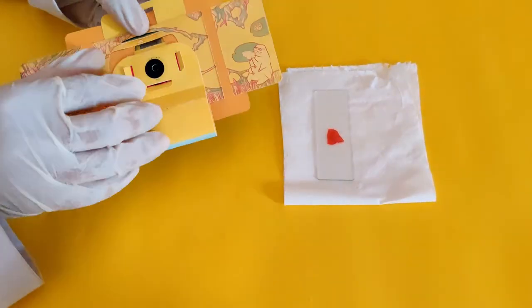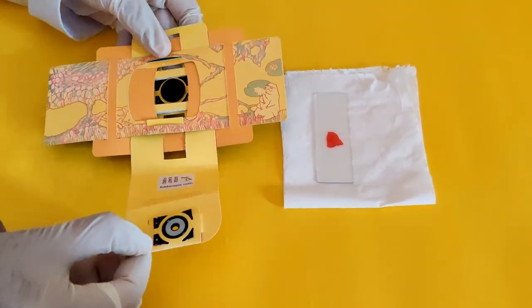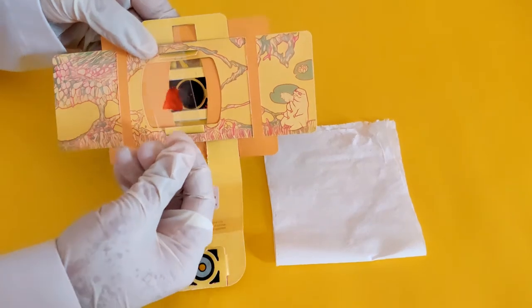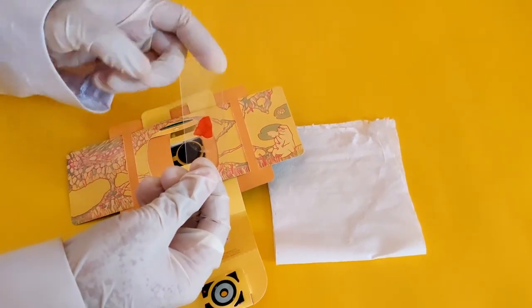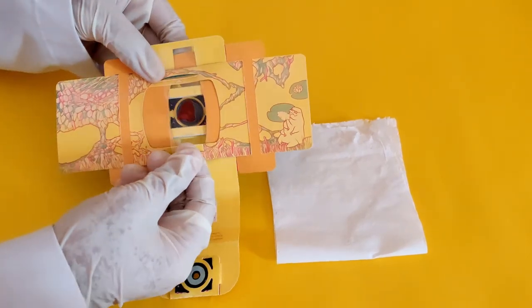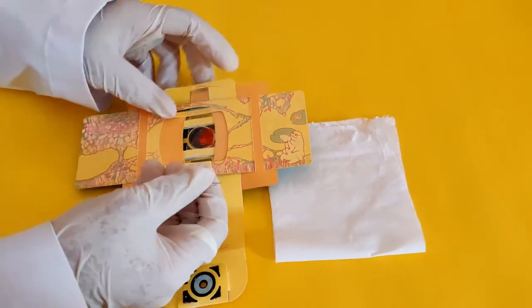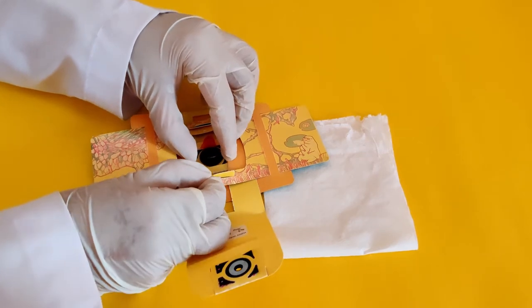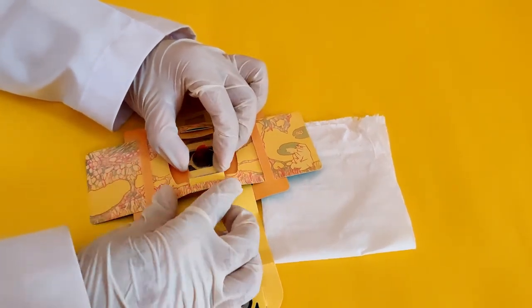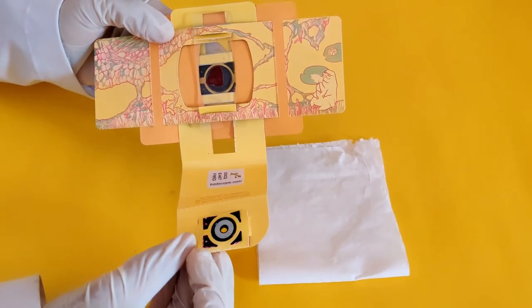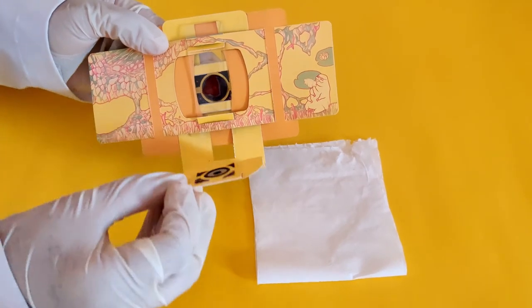Flip the foldscope to the yellow side. Flip the glass slide such that the side where the sample is mounted is facing the lens in the foldscope. Insert the glass slide into the two slits in the sample stage of the foldscope. Close the flap of the lens stage of the foldscope.